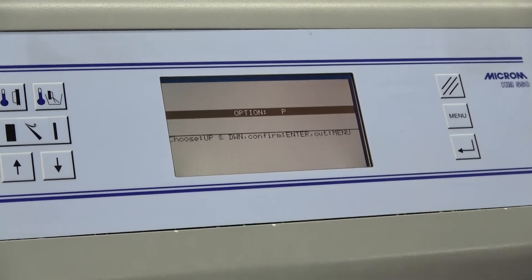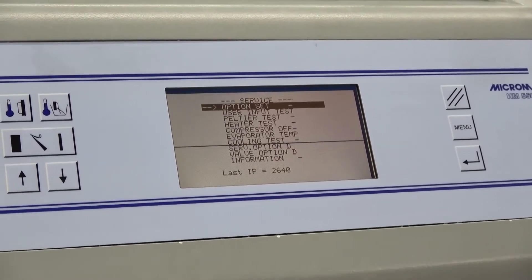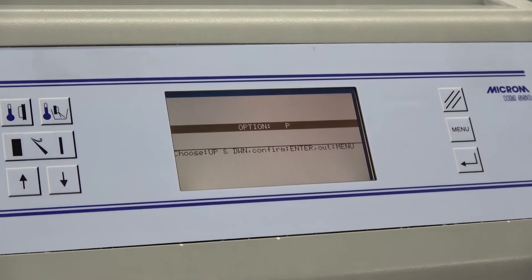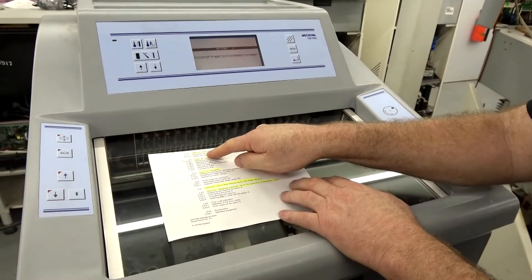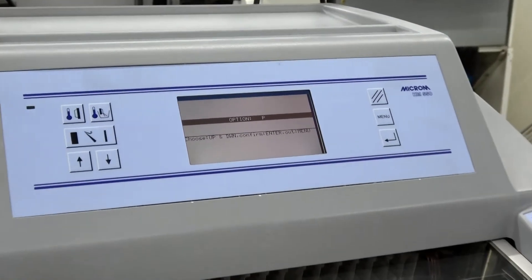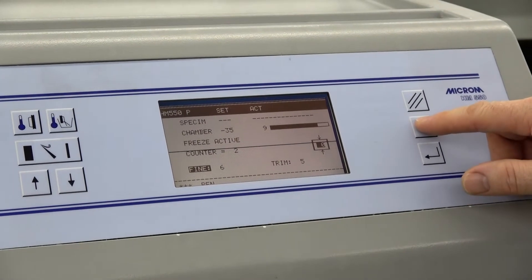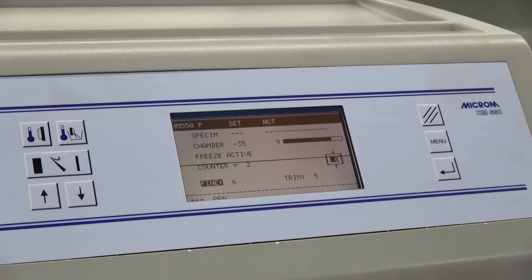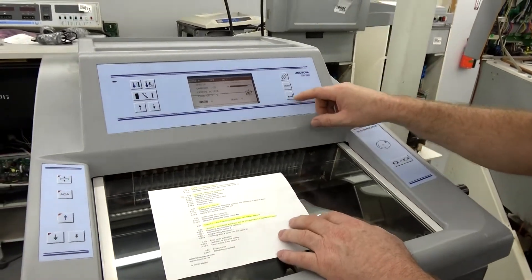So there's VP, MP, and P. I can choose P — that gets rid of my vacuum tome and shuts that off. I hit enter. To make sure it recognized that, I push enter again and it comes back to P, saying this machine only has Option P. In the case of my customer, they want to shut off the specimen cooling, so they'd simply go to Option P — that still leaves them the active deep freezing and shuts off the specimen cooling option. Hit enter, hit menu, menu, and now we're all the way back out. Now my vacuum is shut off — it doesn't work.